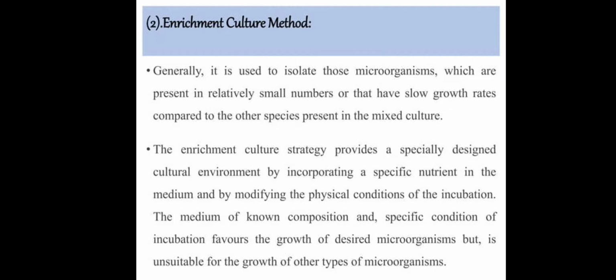The medium composition and specific conditions of incubation favor the growth of the desired microorganisms but are unsuitable for the growth of other types of microorganisms.